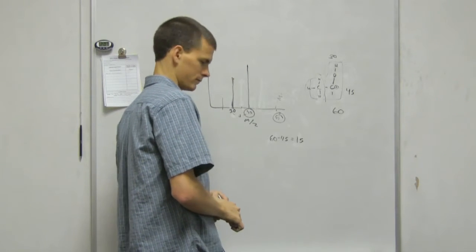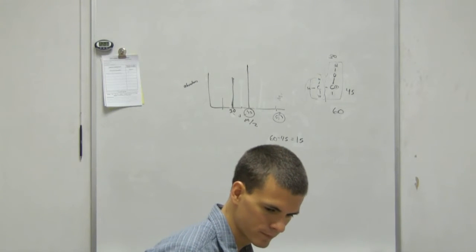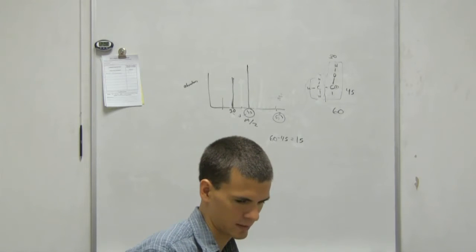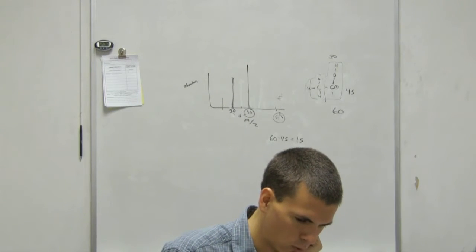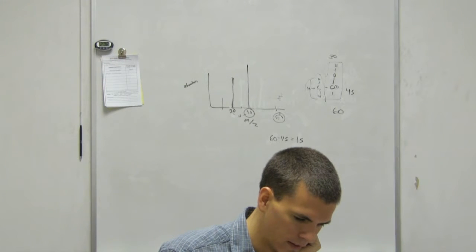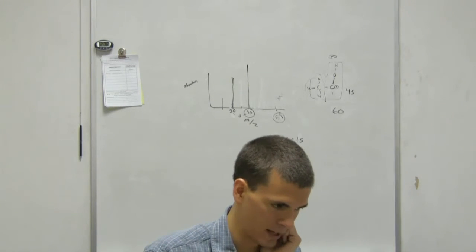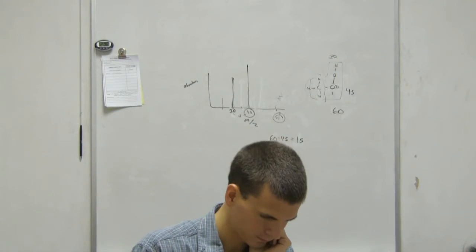So you're talking about this part, right? Yep. They're talking about that one, and then the big line is how much you lost, right? Yep, exactly. Oh, I see. That line is this whole molecule. Okay. This line is what's left when you lose 15 units of mass. Okay, I see.